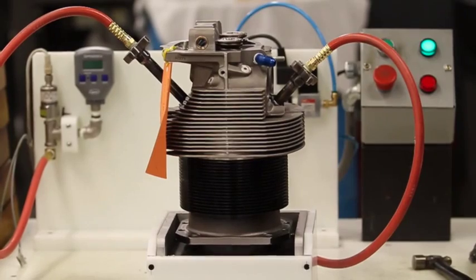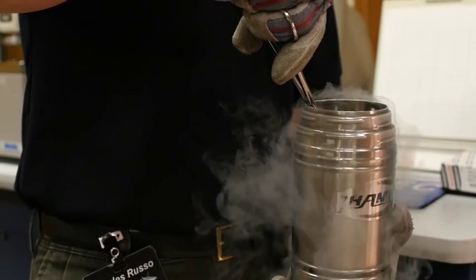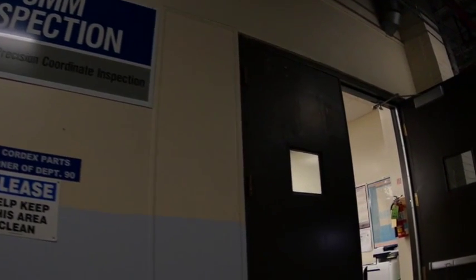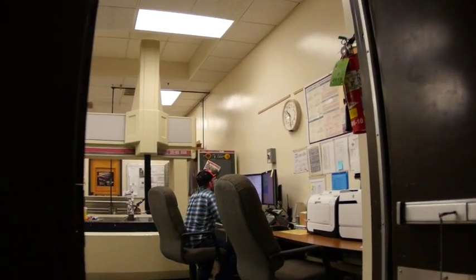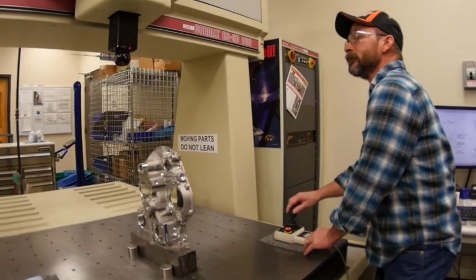The lab performs destructive and non-destructive testing of components from both internal and external suppliers to ensure that all materials conform to Lycoming's strict specifications before they become part of our inventory. We also perform safety analysis for the Federal Aviation Administration and the National Transportation Safety Board.